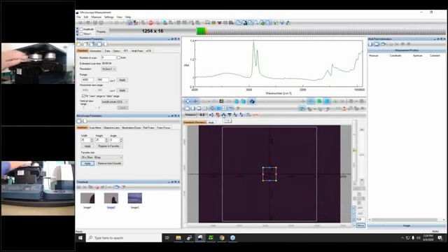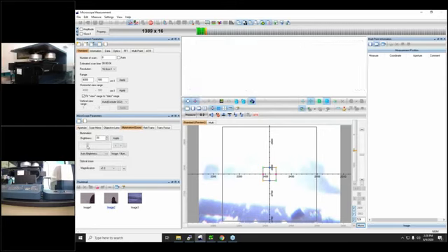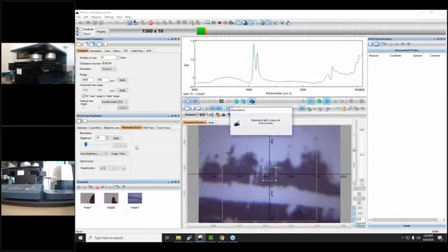Now the crystal is in contact with the sample, and what I did just now is change the optical path for the ATR objective.